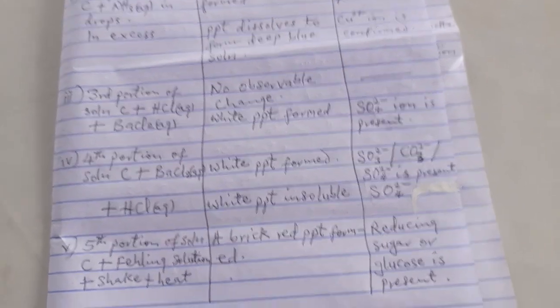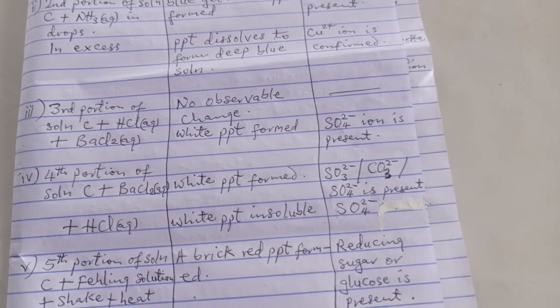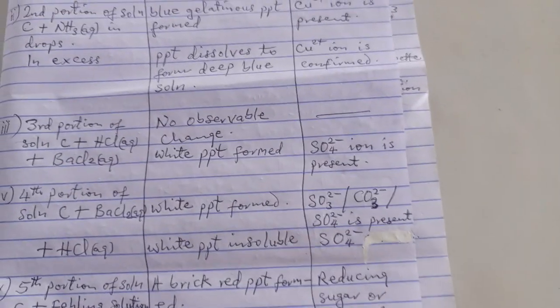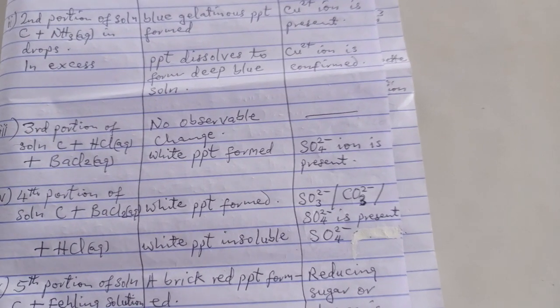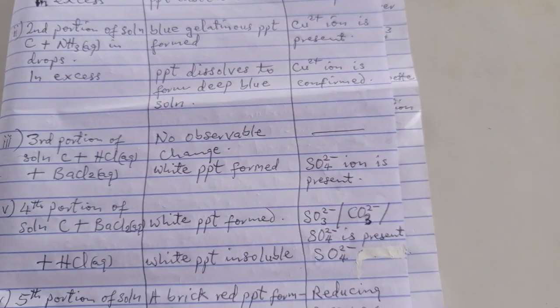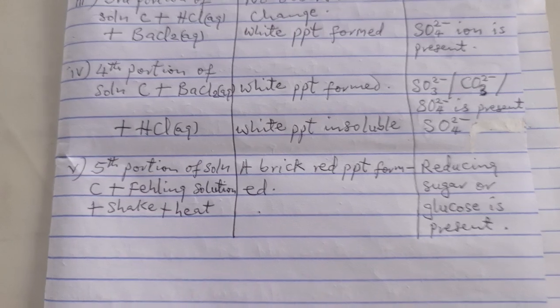So when you add barium chloride first, by the time you add HCl to it, if it is SO32- or CO32-, they will dissolve. But if the PPT refuses to dissolve, that means SO42- is present. You report that.